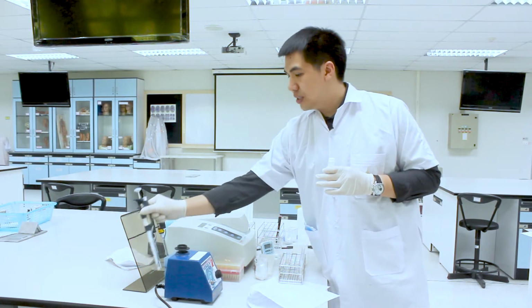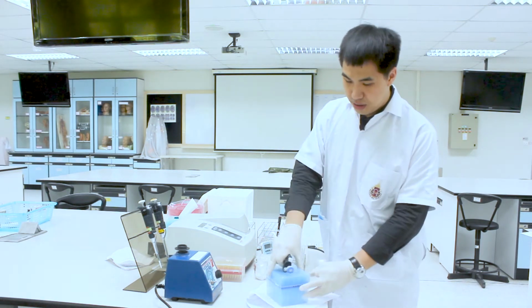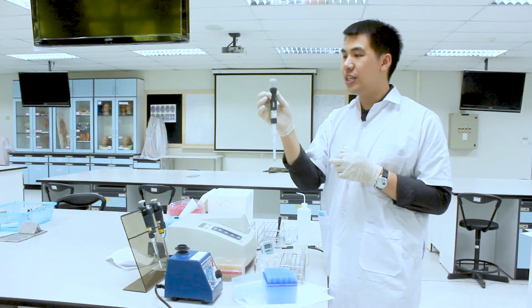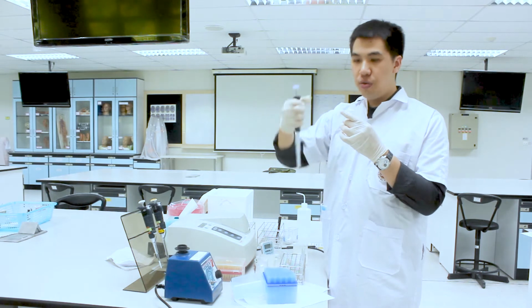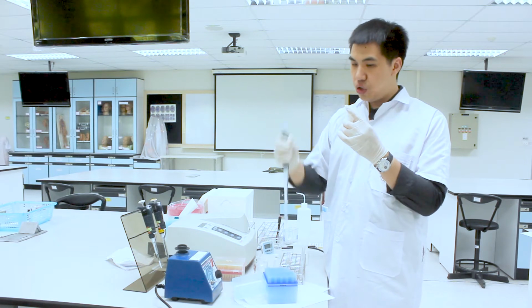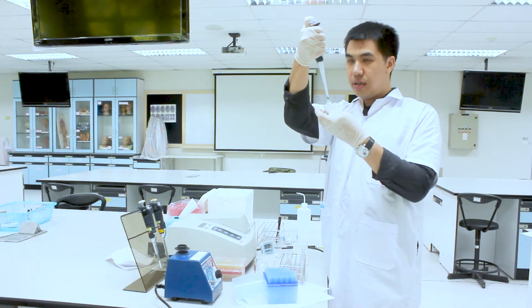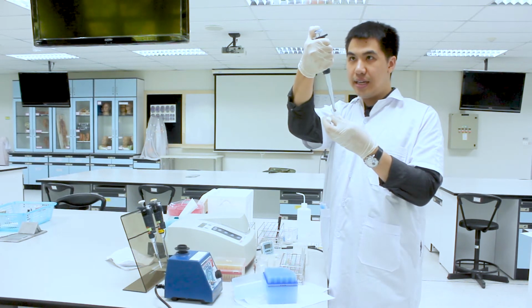So you use the big autopipette here and adjust the scale to 100, but actually it's 1000 microliters. Be careful that when you draw the solution up, it can have air bubbles in it. So you should draw up the solution slowly, and gradually release the tab here.